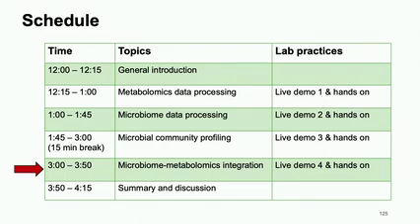And I realize at the beginning they chose a different option. All of this speaks to the concept that some of this initial data treatment does have an effect most of the time, but the overall pattern of function is very, very robust, and we can see that.